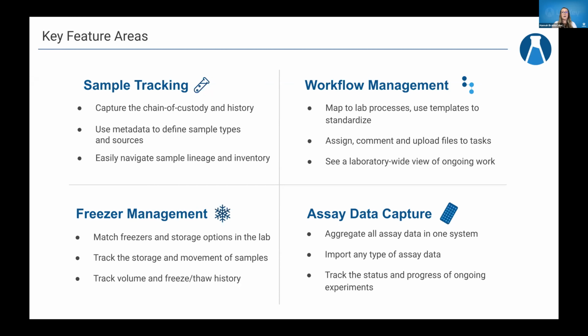You can assign and comment and upload files to tasks. So it's really meant to be this kind of live space for you to be able to assign work to different people and collaborate with teams, and then be able to comment back and forth on what might be going on and share files as needed as well. And then really giving you that lab-wide view of ongoing work that's happening. So you get a sense of what you need to do in any given day, but you can also see what the team's doing and help manage their workflows.